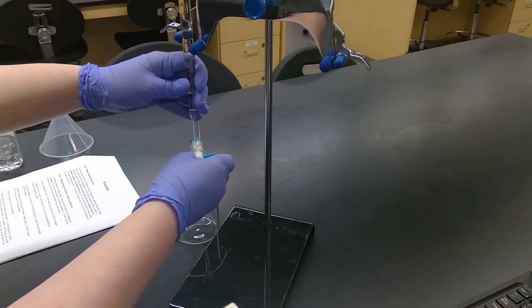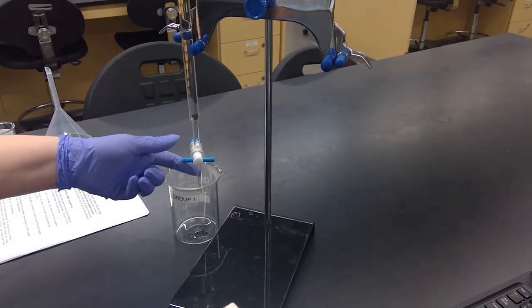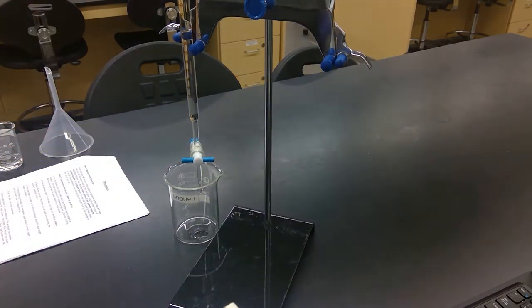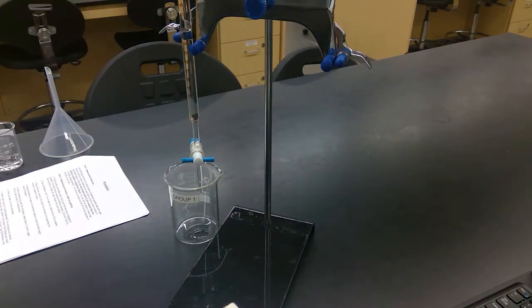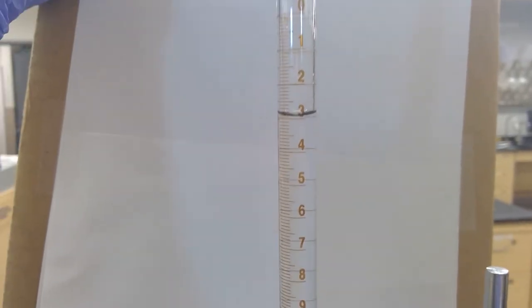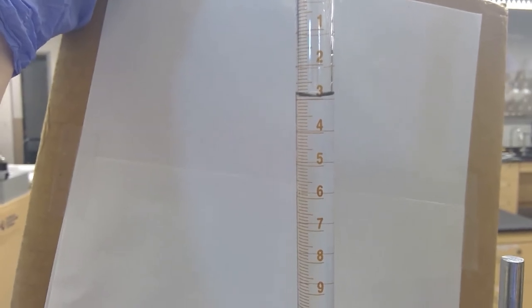You don't want to just open it and leave it there because it'll continue to go down. You just want to open it enough that there isn't any air bubbles left in here. Now the burette is full through the tip and we can take our initial reading. Record your initial volume.